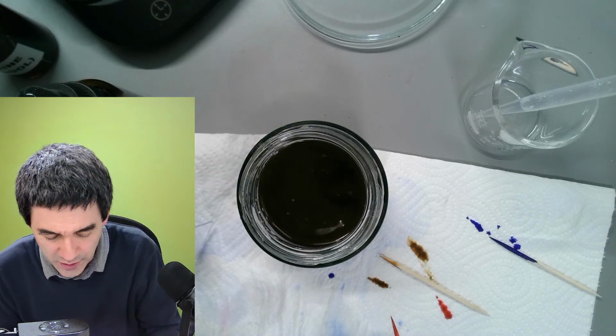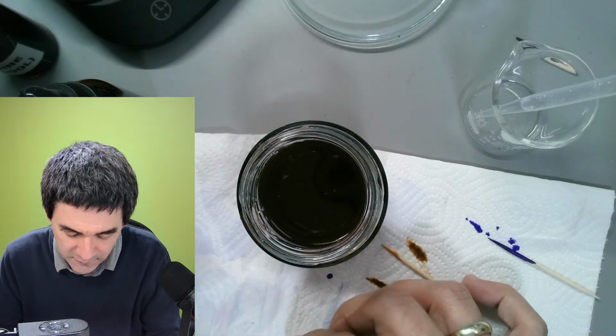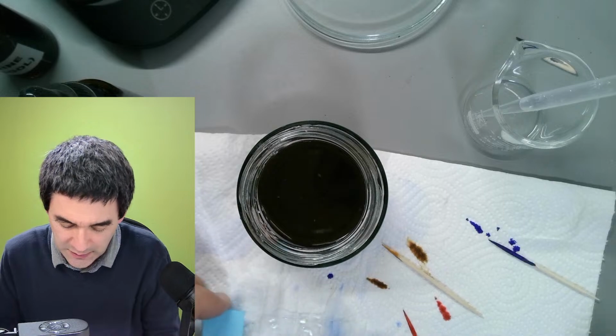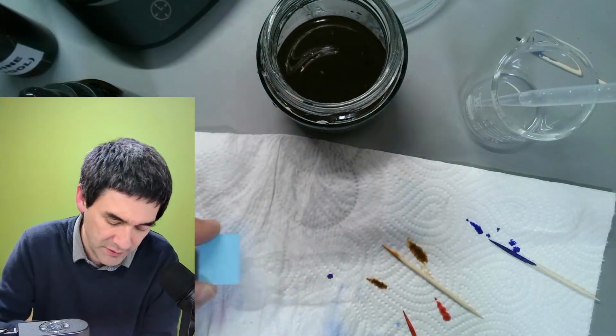I think it should have completely de-stained by now. The next thing is the following. It says I should quickly rinse again to remove the alcohol. And the last stain is the counterstain, which is now the safranin.